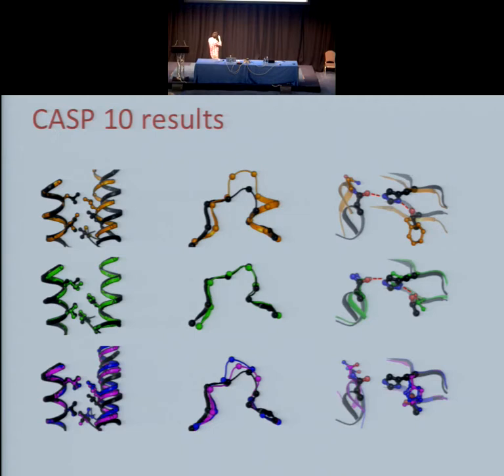So what happens here is these two helices, to accurately capture their side chain packing, you really need to let this helix move off template somewhat. And so the side chain, or excuse me, the backbone stitching and the centroid minimization that Rosetta does is able to capture exactly that. We get the helices placed almost perfectly, and the side chain packing is almost perfect. This is a little bit off. But you can see that the other methods just can't make that movement from the template to the native structure. And you see that again in these two cases as well.